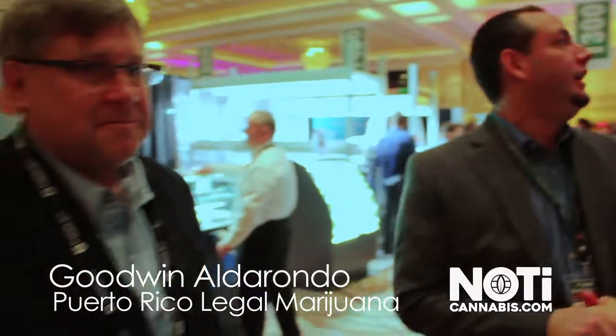Hello everyone! We are here in Las Vegas at Cannabis Business Expo with our friend Kinton from Coroldan Extractions, and he is going to talk to us a little bit about what this machine does.